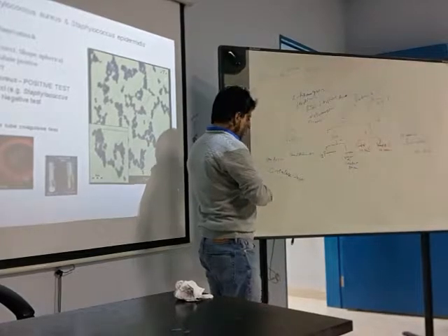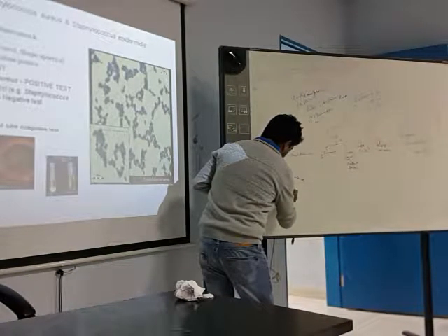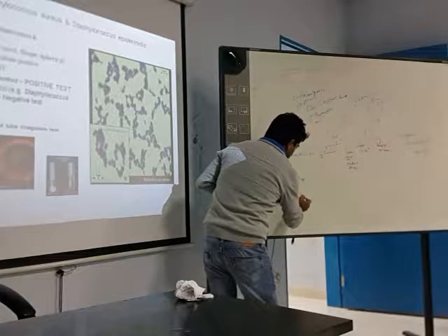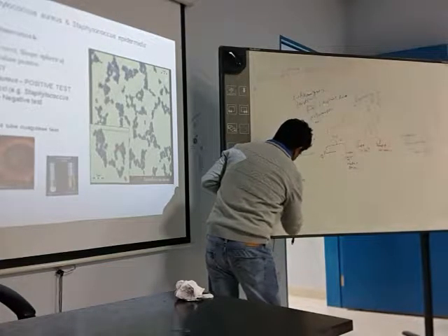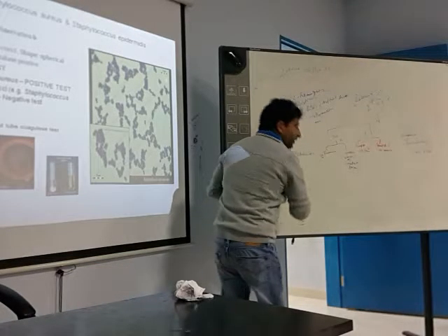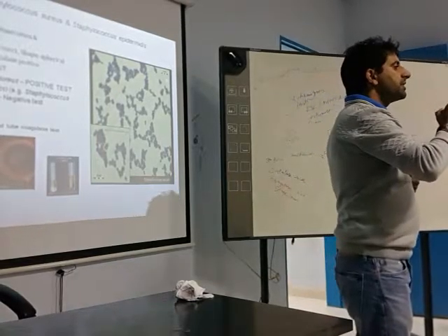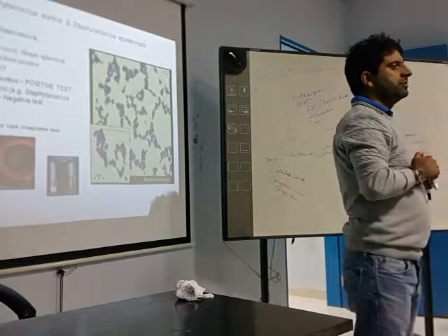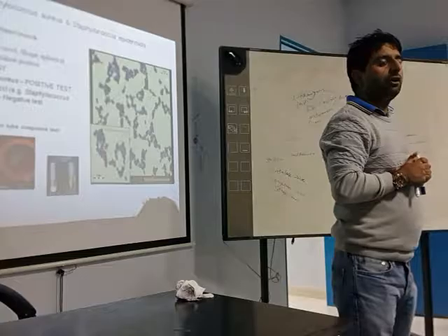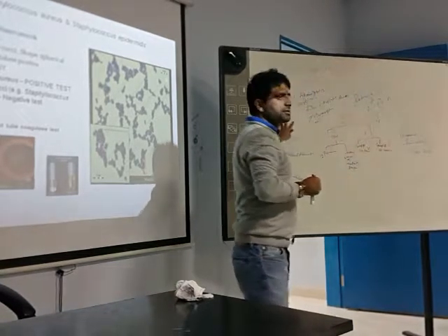But one more test is coagulase. Only aureus. Always remember, in the whole Staphylococcal family, Staph aureus is coagulase positive. The rest are all coagulase negative.